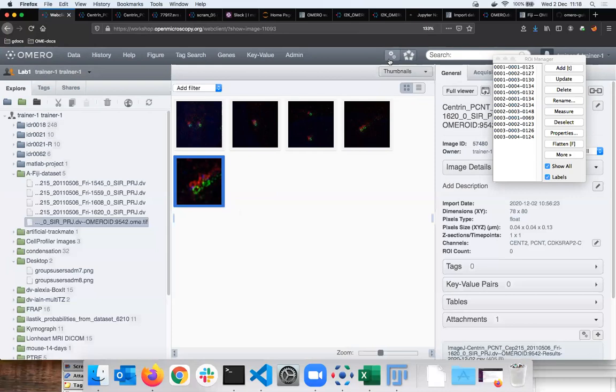I can have it in a remote place, which is my laptop here under not-so-good broadband in a private flat, or I can have it on a cluster which is close to this OMERO server, and the connection between them is on the university network, which is much better. Or I can indeed run some analysis scripts directly on the server, which is the thing I'm going to show you right now.